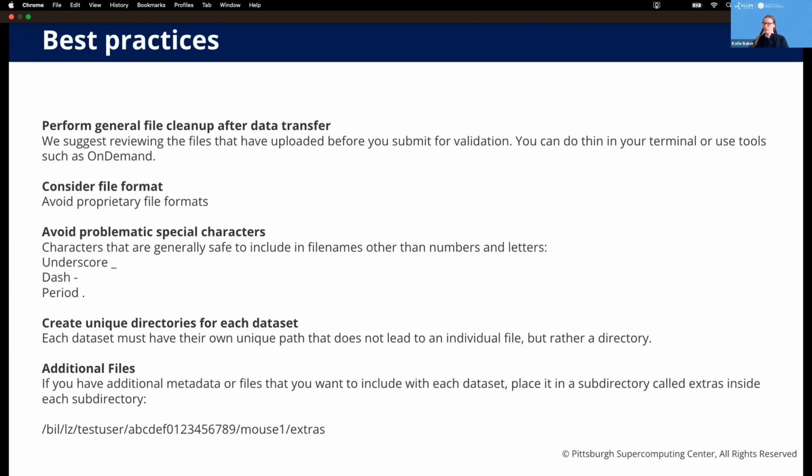Oh, okay, I see. That makes sense. Because the scientist I was working with wanted to put the processed data and the raw data in sibling folders, in the same section, because they felt that way it was easier to link up the raw data, which is mostly proprietary format unfortunately, and the processed data, which is TIFF files, some cell by gene matrix, that kind of thing.